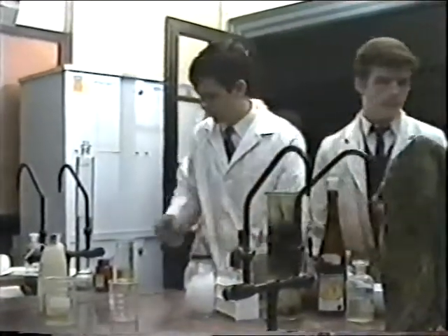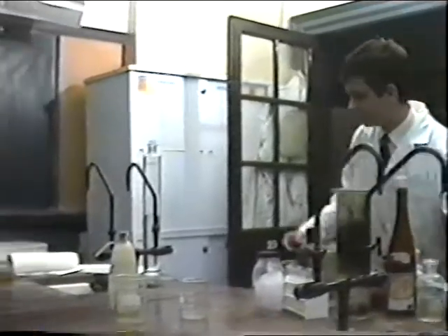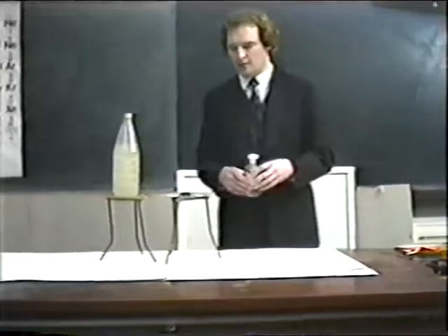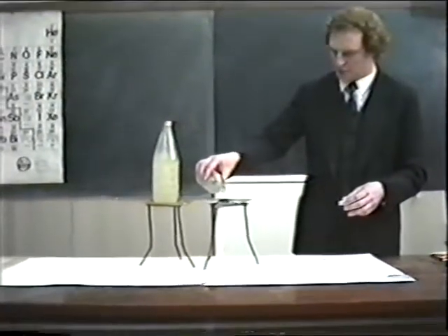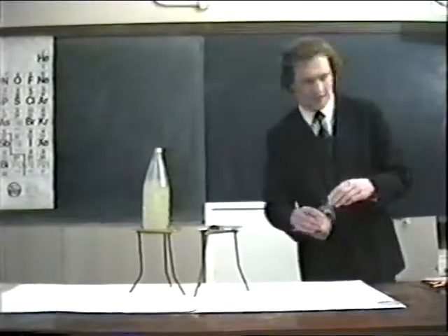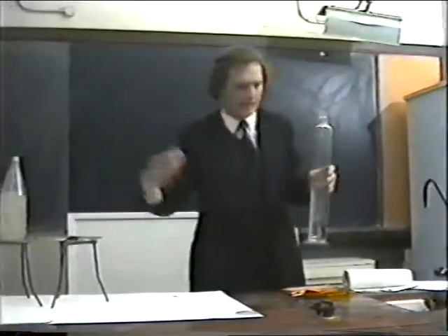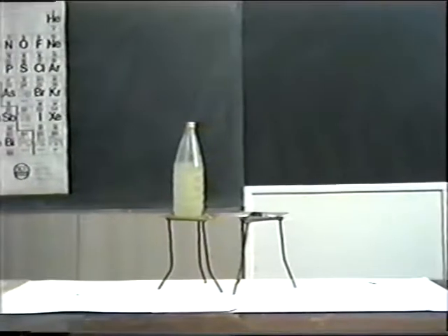Now, in this reaction, we are going to observe the chain reaction between hydrogen and chlorine, which goes off with extreme violence, set off by a bright flash of ultraviolet light, which will be generated by the flash powder which I have produced. A couple of drops of water help to catalyze the reaction, and we can stand back and watch.